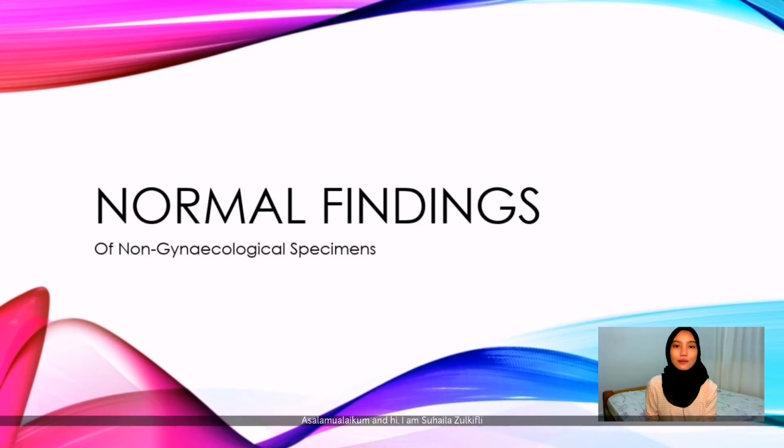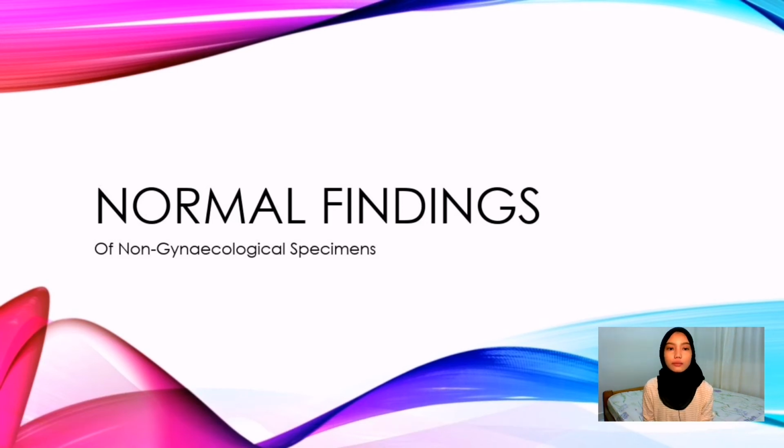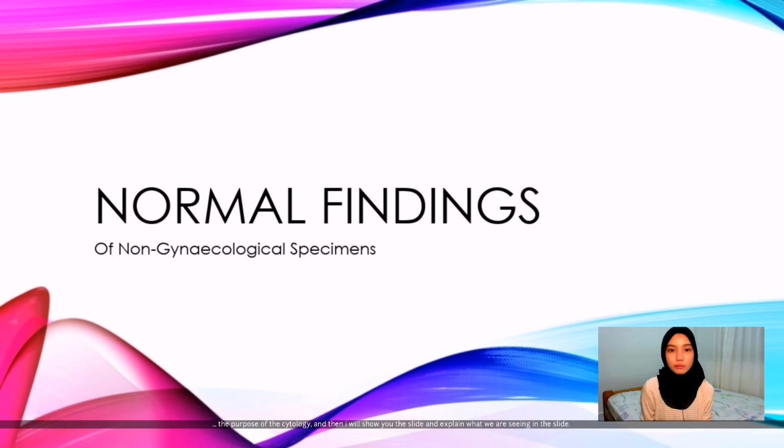Assalamualaikum. Hi, I'm Suhaila Zulkifli. So in my part of this video presentation, I will be presenting to you the normal findings of non-gynae specimens. First and foremost, I would like to explain my part. It will be pretty straightforward because I will first briefly explain to you the purpose of the cytology, and then I will show you the slide and explain what we are seeing in the slide.